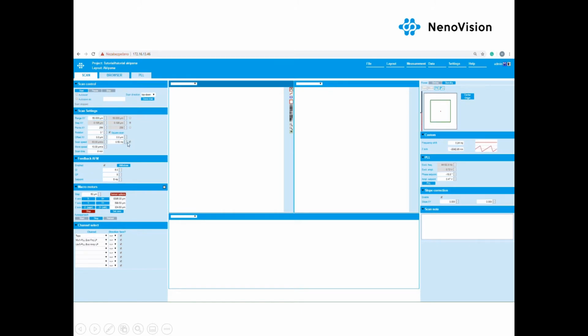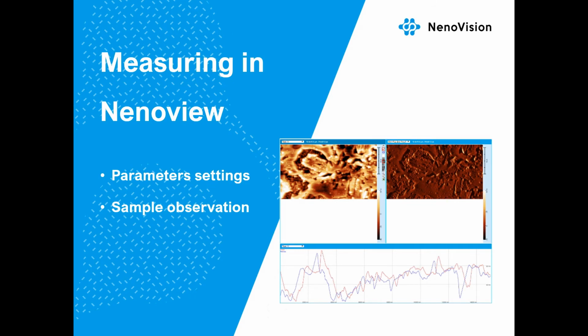The process is repeated till the tip is in contact with the sample surface. Because the piezo is expanded too much here, we use the withdraw button and get the tip closer to the surface by macromotors. When we enable the feedback, the piezo is expanded again, moving the tip to the contact. As we approach the tip to the surface, we are going to set and adjust the image parameters and measure the sample surface.